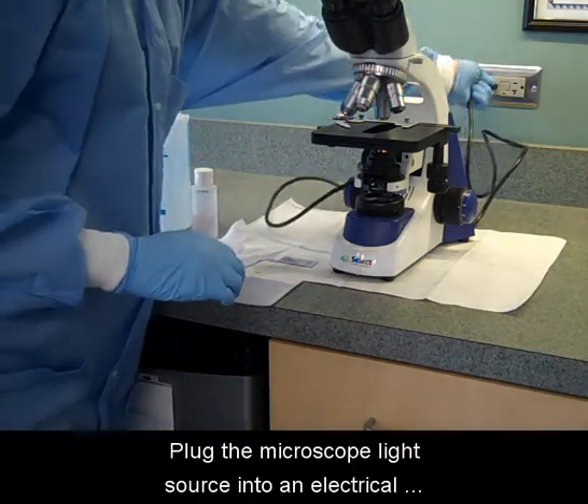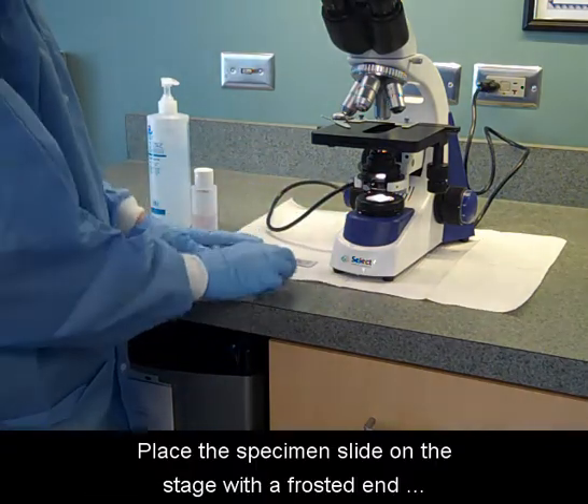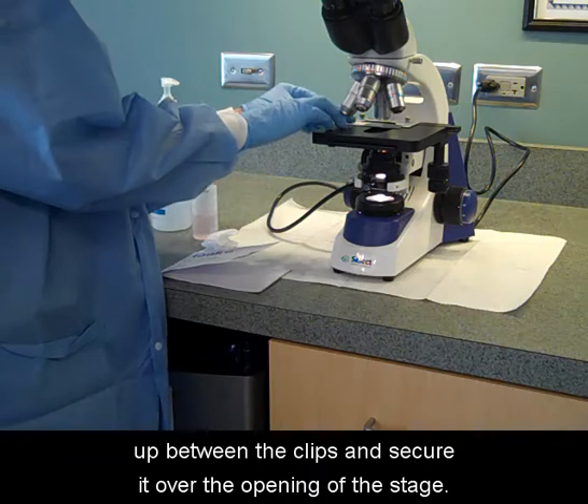Plug the microscope light source into an electrical outlet and turn on the light switch at the front base of the microscope. Place the specimen slide on the stage with the frosted end up between the clips and secure it over the opening of the stage.